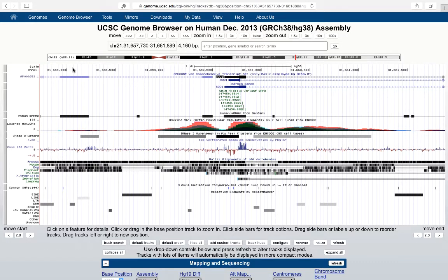Directly below this track is another track related to regulation called DNase1 hypersensitivity. These are regions that are sensitive to DNase activity, and they tend to fall in regulatory or promoter regions.